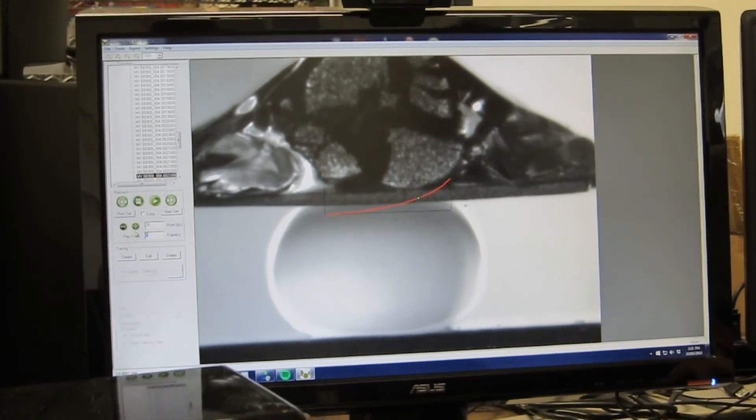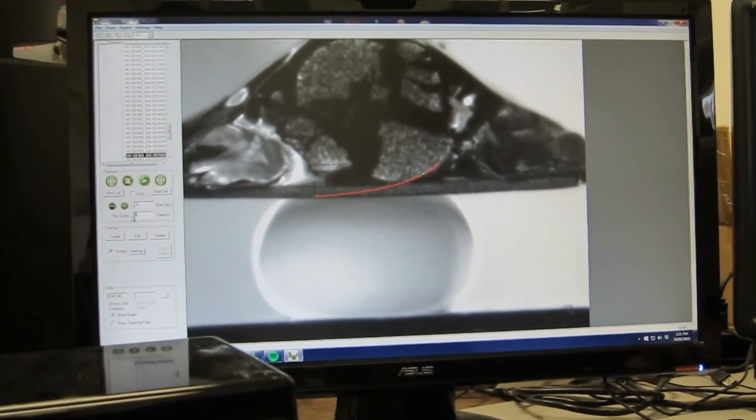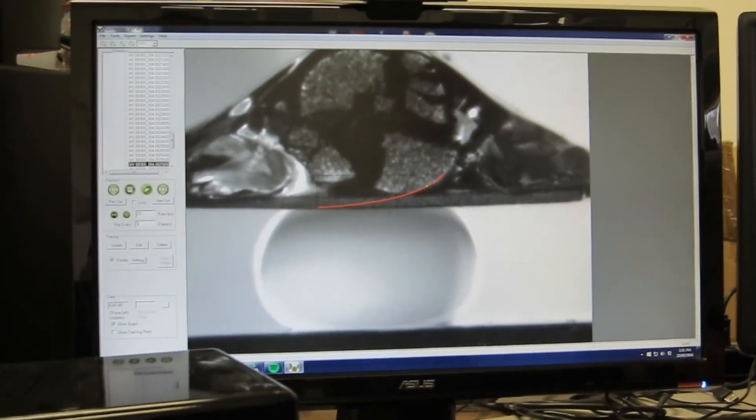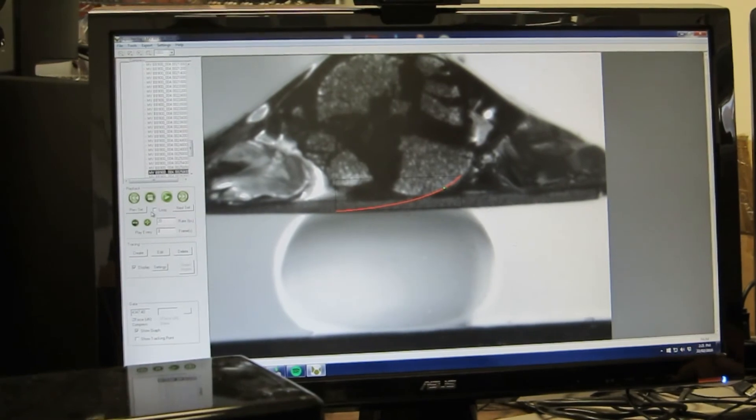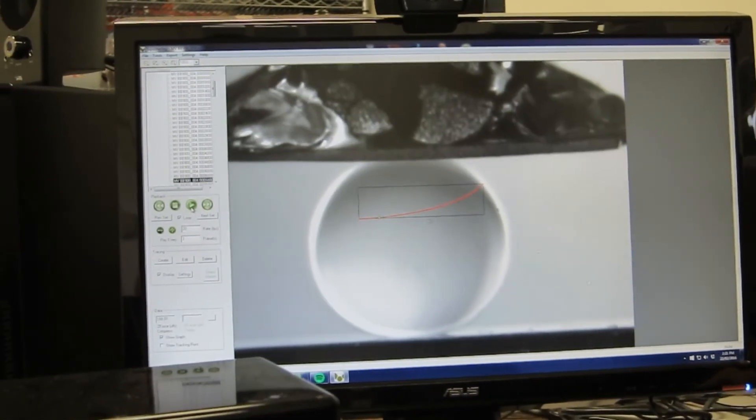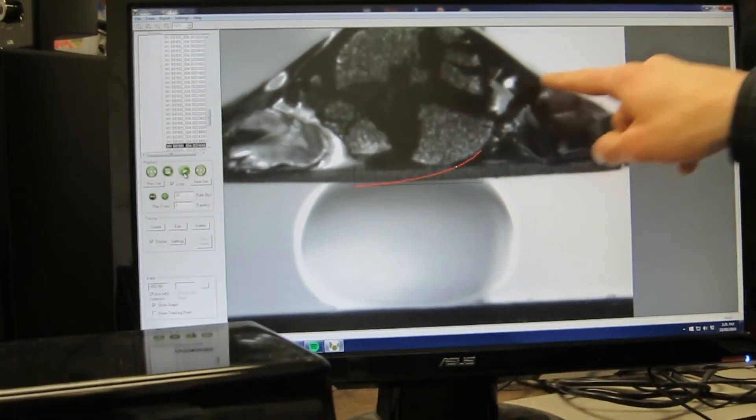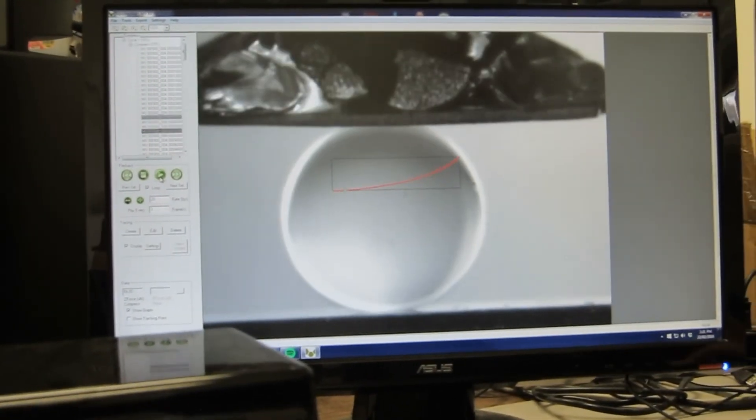So that I can, I'll just run that really fast here so we can see that. So there's what's happening. While I'm doing the compression you're seeing the forces ramp up.